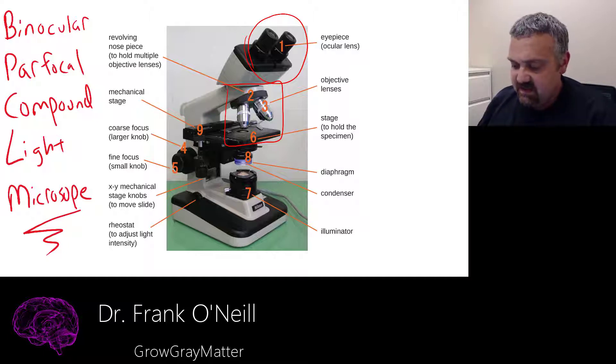Compound tells us that this is a multiple lens system. Traditionally, simple microscopes just had a single lens system, maybe a round lens or a glass ball. But compound light microscopes have a second lens up in the ocular. So here we have our objective lenses that have already boxed in there.